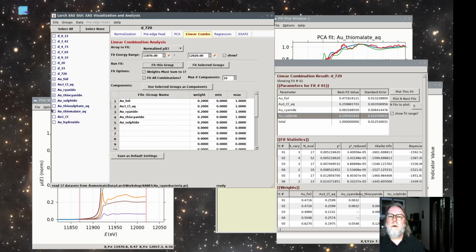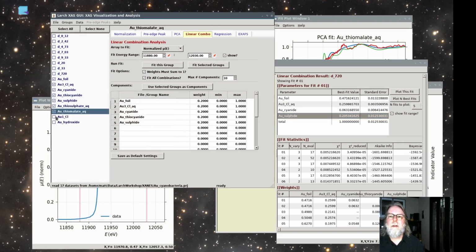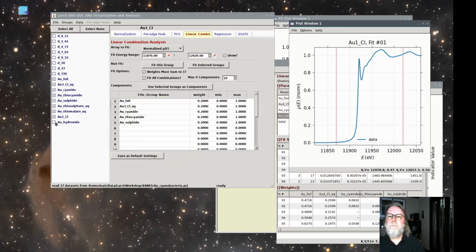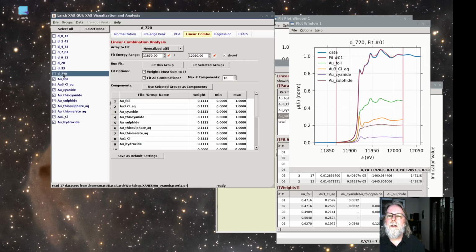So we could also go here and just add more of these component spectra. I'll say use a selected group. So now we have 9 components. Probably not all reasonable to think that they're distinct, and we can take this one data set and fit that.